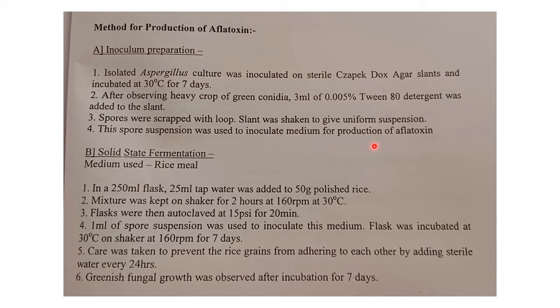Now we have the isolate and the spores from the Aspergillus, and we are using them to produce aflatoxin. For that, solid state fermentation is used.